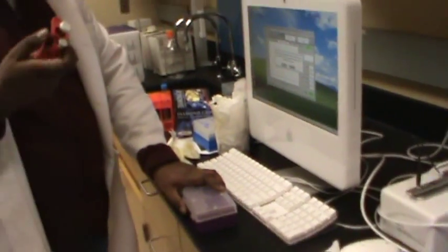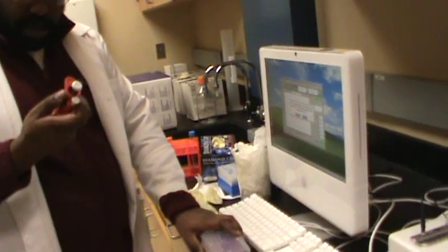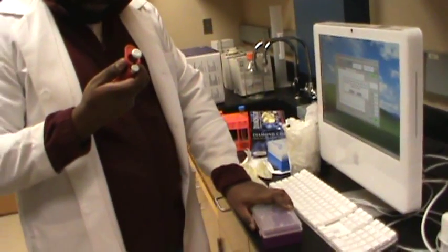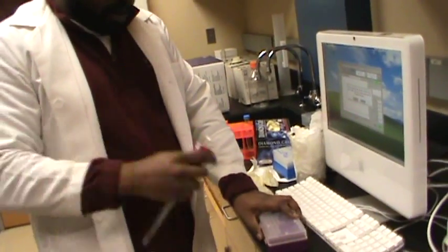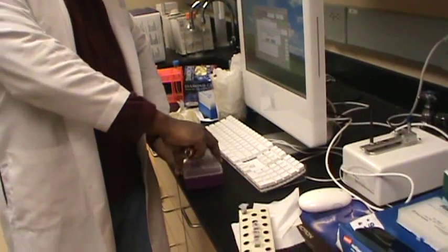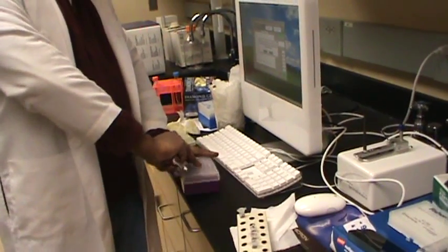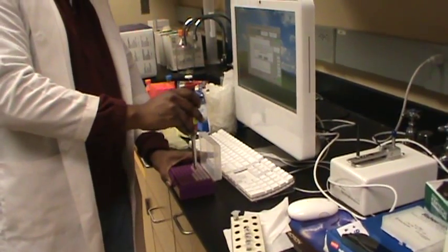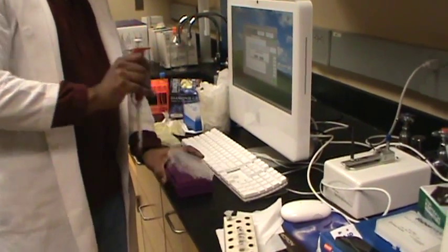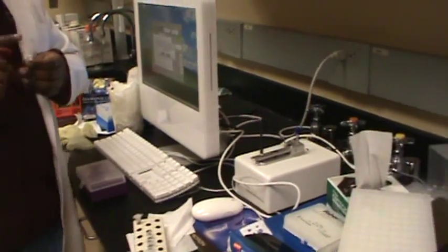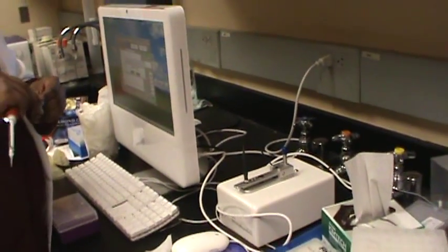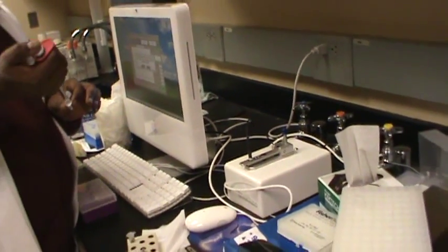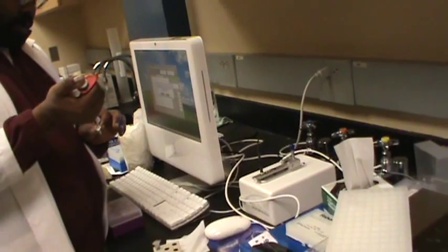Last time I was here I cleaned it, so I don't think anybody has used it since. Take five microliters of nuclease-free water just to clean the pedestal.